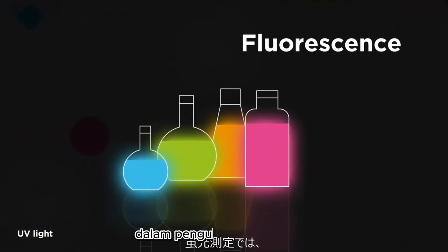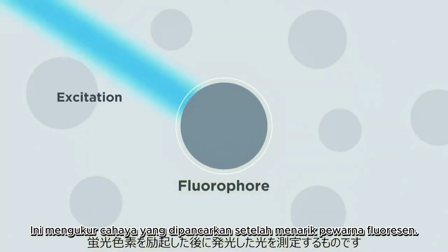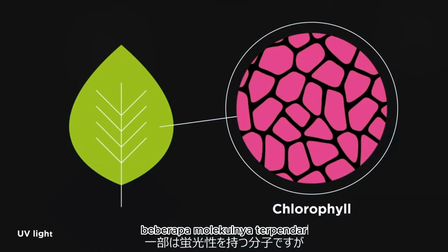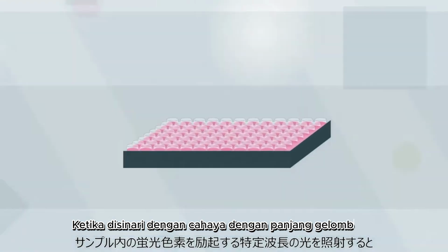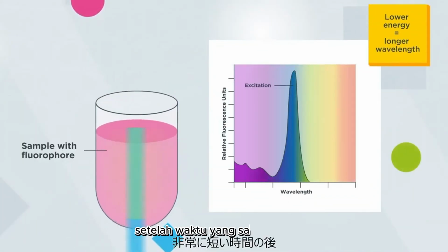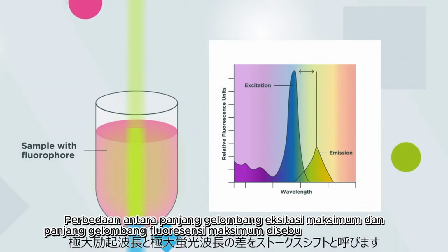The basis of fluorescence measurements lies in fluorescent molecules, called fluorophores, which, after excitation, emit light. Some molecules are naturally fluorescent, but most need to be tagged with fluorescent dyes. The light of a specific wavelength excites the fluorophores in the sample. After a very brief period, light is emitted from the molecule at a longer wavelength. This difference between the peak excitation and emission wavelengths is called the Stokes shift.